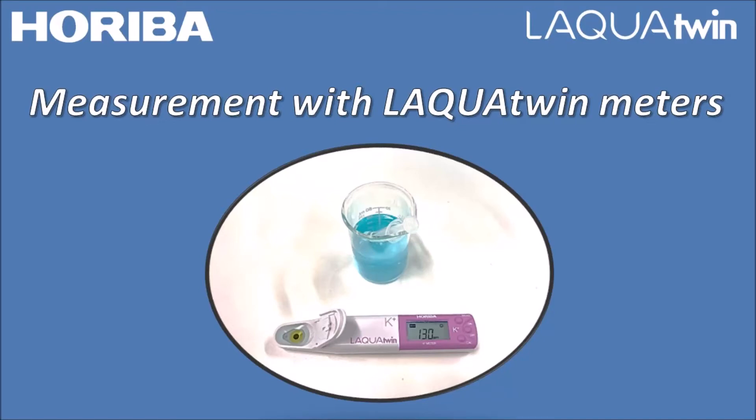Hello, welcome to Horiba Laqua Twin channel. In this video, Horiba will share measurement procedures for Horiba Laqua Twin meters.